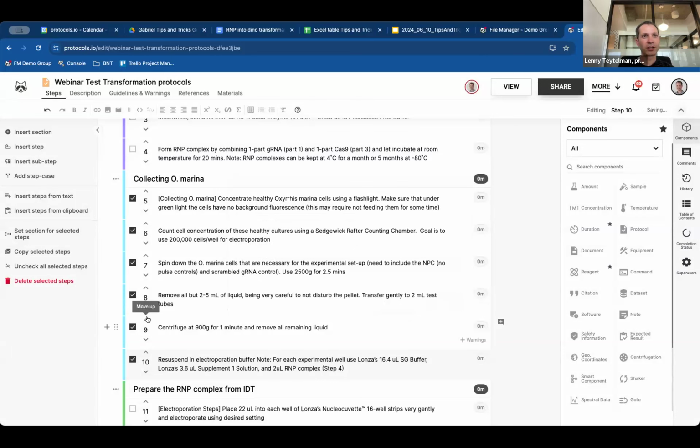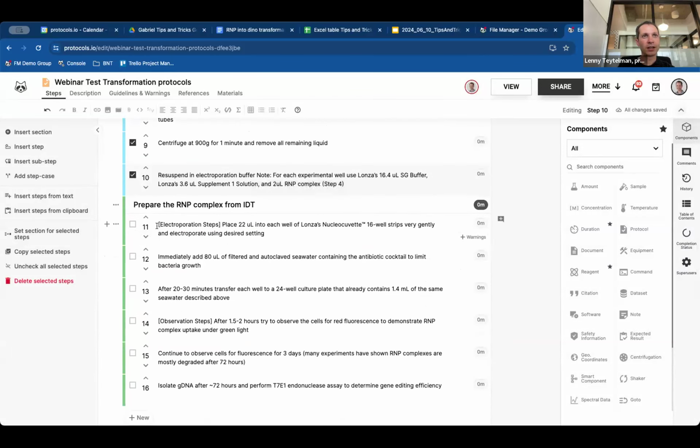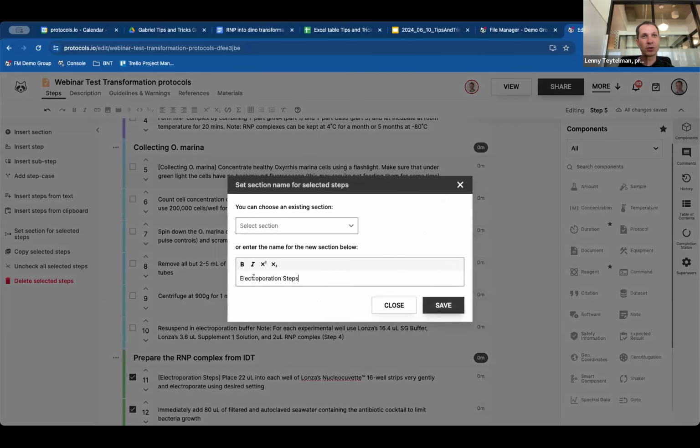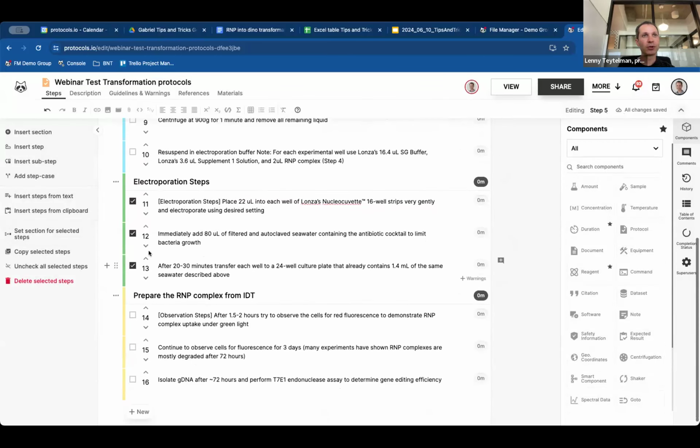There we go, it gets a different color. So this is section 2, and then the remainder, I believe, these steps are yet another section. We're not going to do all of it, but just to demonstrate the functionality. And I will say in a moment why it's not just a nice visual thing to set the sections, but how it's helpful.